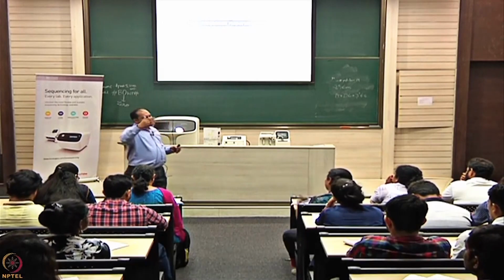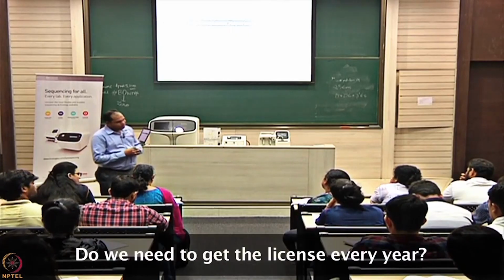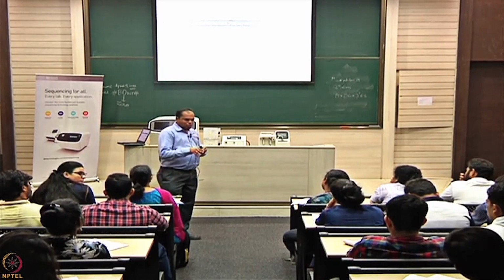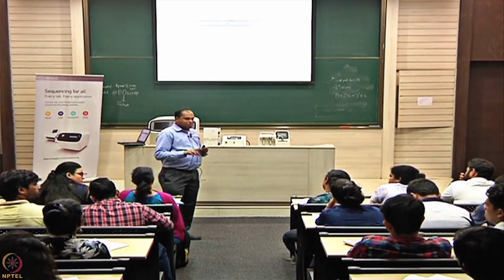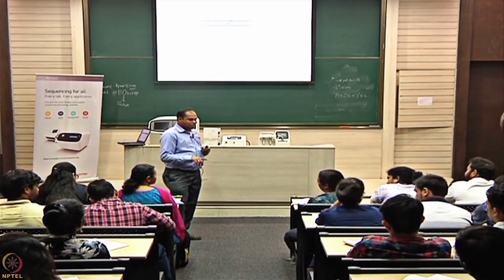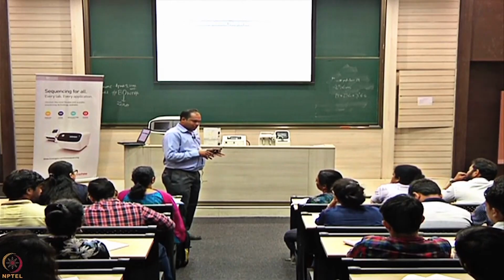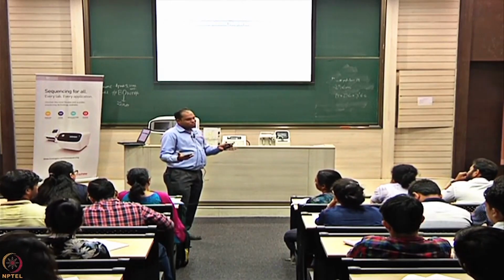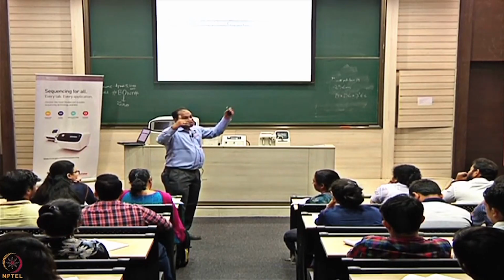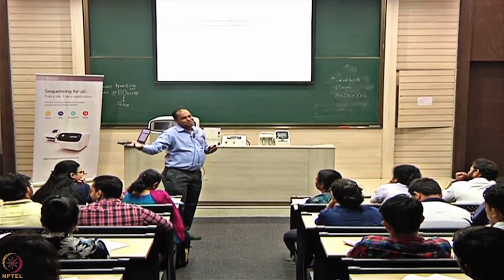So there is an update happening on the cloud every few months. So the license goes everywhere? There is nothing like a license over there, actually. What happens is, you are given around 100 GB of space on the cloud. If you are taking the same system as a local server, there are 2 versions of it. One is the Ion Reporter Cloud version, which is online, which gives 100 GB free space. Once your space is full, you need to buy some more space.